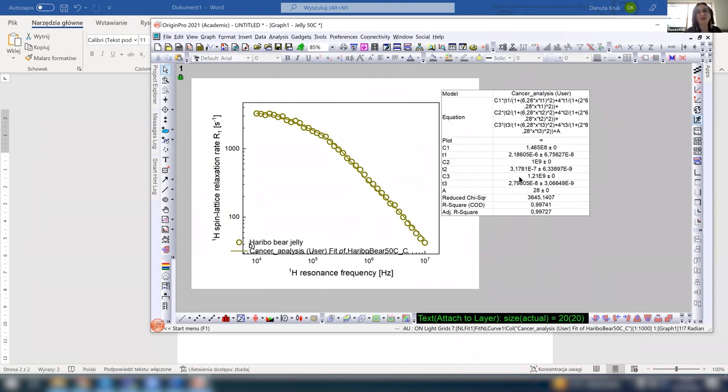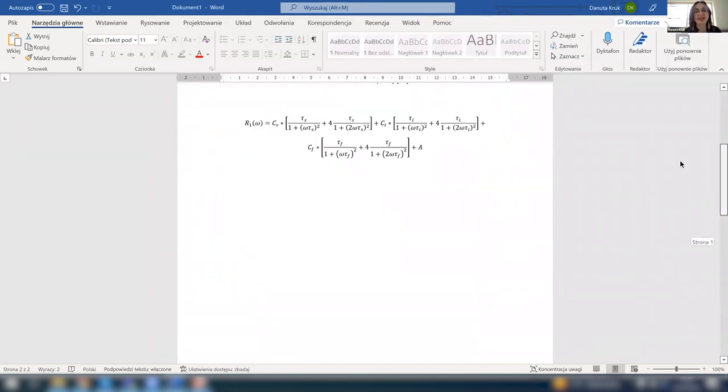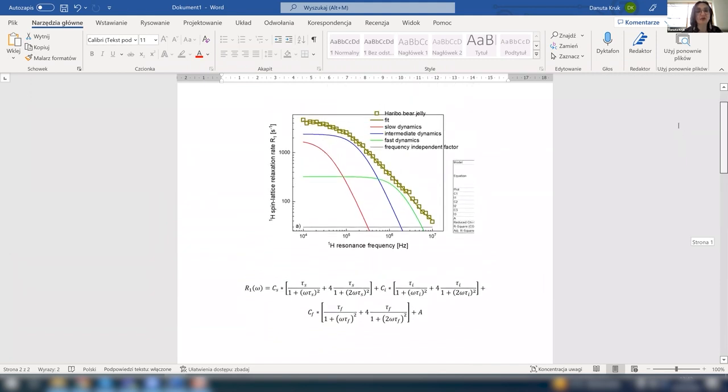And what happens? The software is intelligent enough to decide. So for instance, if one of the contributions is very small, you can always plot the contributions. And if it turns out that this green one, for instance, is just somewhere here, so you clearly see that it is not so important, this contribution. Then I would recommend to limit the fit to 2 of them. But first one should see this picture, just to understand the extent of the contribution of each.